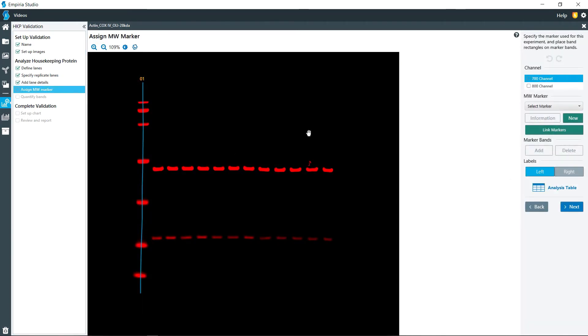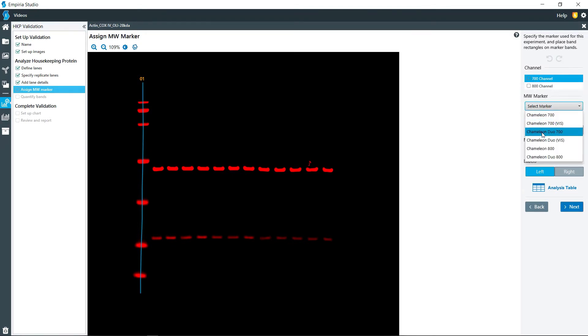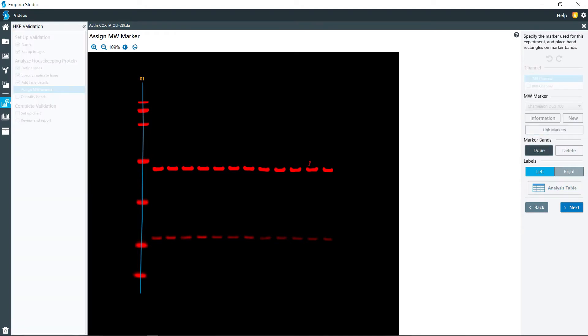We're going to assign the molecular weight marker. So here in the 700 channel, I'm going to go with the Chameleon Duo 700 and I'm going to add the bands on here.